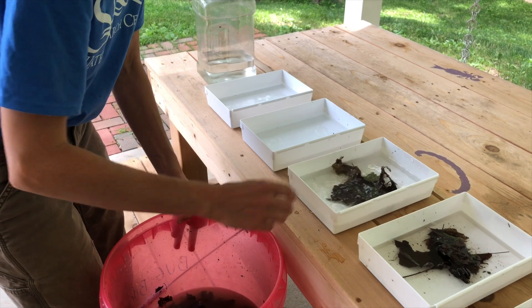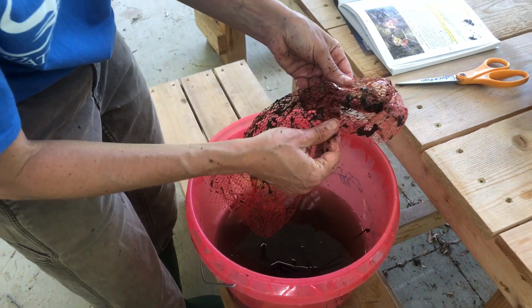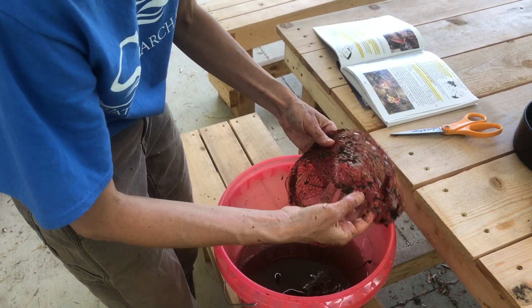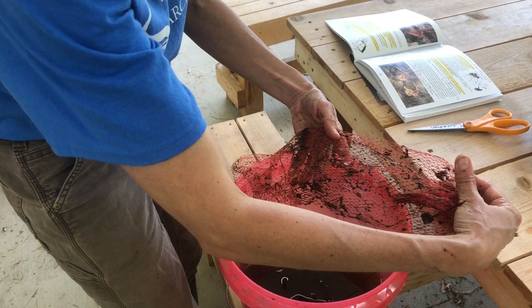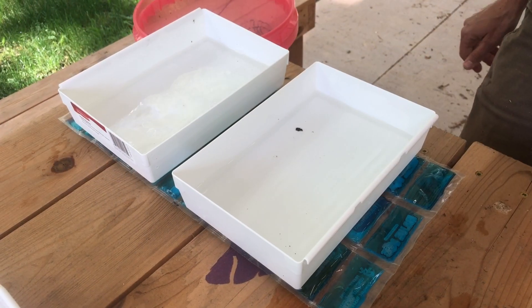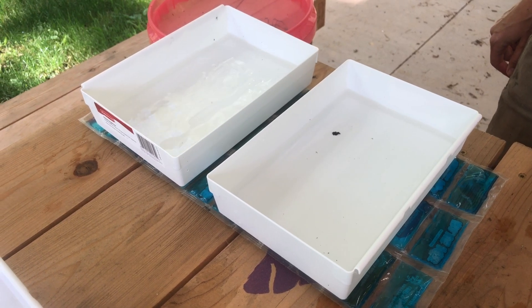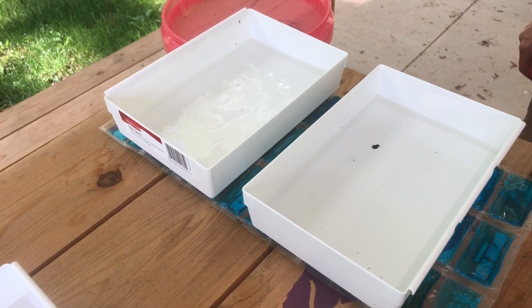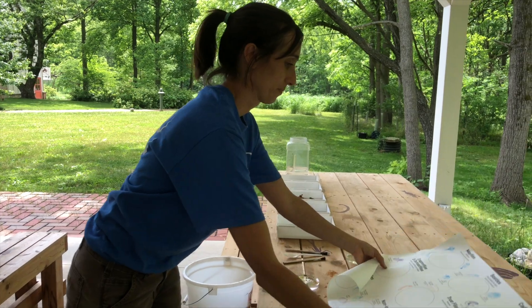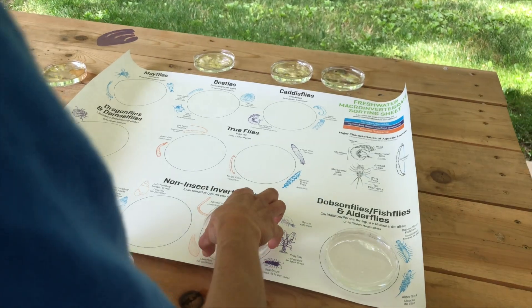Divide the pack contents among sorting trays that contain a couple of inches of stream water. If time allows, check the reserved leaves in the leaf pack for any macro invertebrates that may have been overlooked and add them to the trays. Repeat for each leaf pack. If the water in the trays begins to become too warm, place the trays on a plastic bag filled with ice — or like we show here, an ice pack — to keep the macro invertebrates cool.